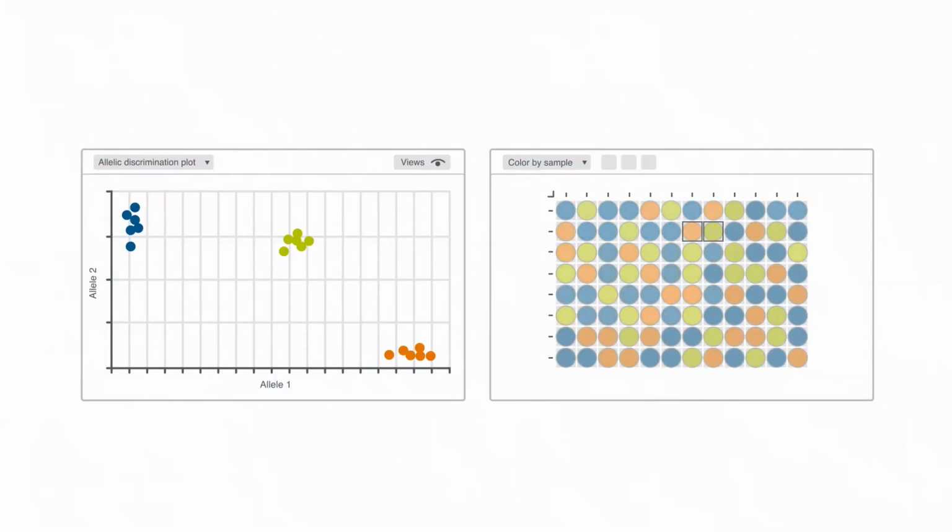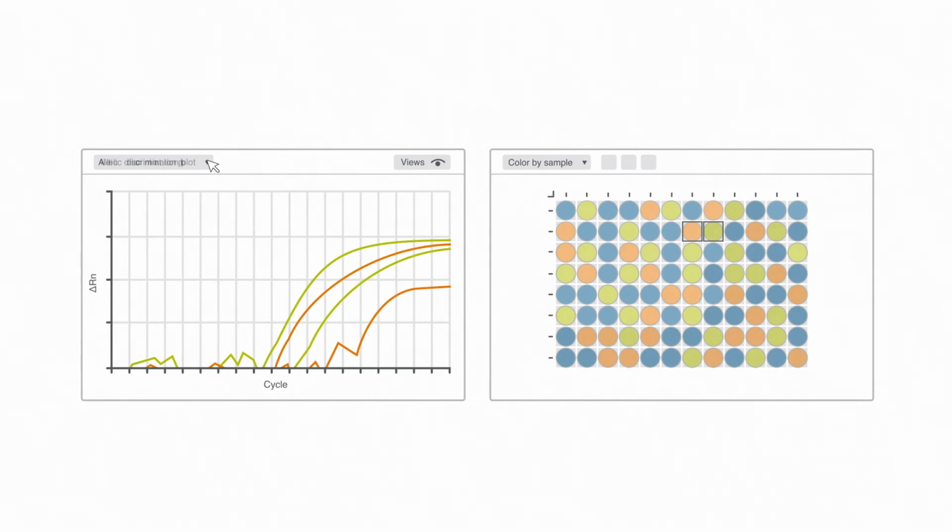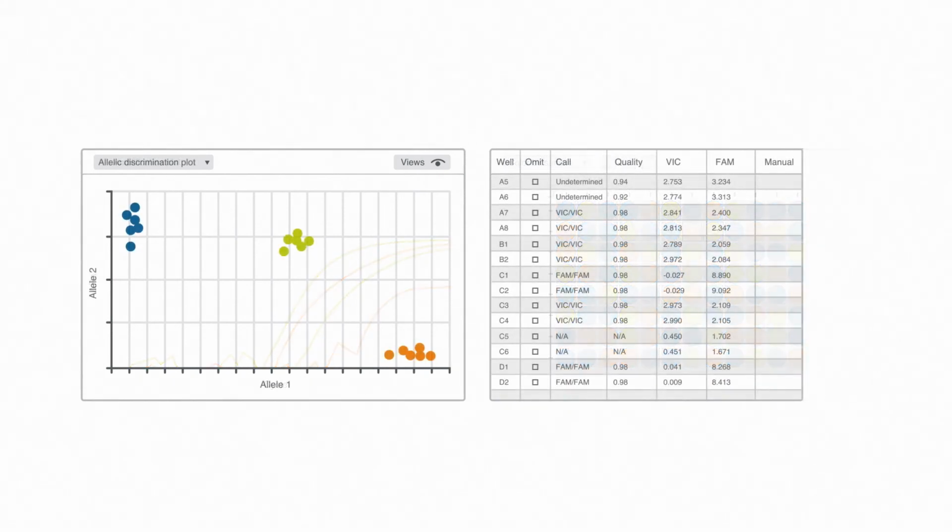If we look at 2 respective samples, we can see there's a difference in the amount of VIC amplification. So, even though there may be some mismatch binding, we can still differentiate the clusters. To account for mismatch binding, a quality value, which is the probability of a genotype call, is assigned to each well.